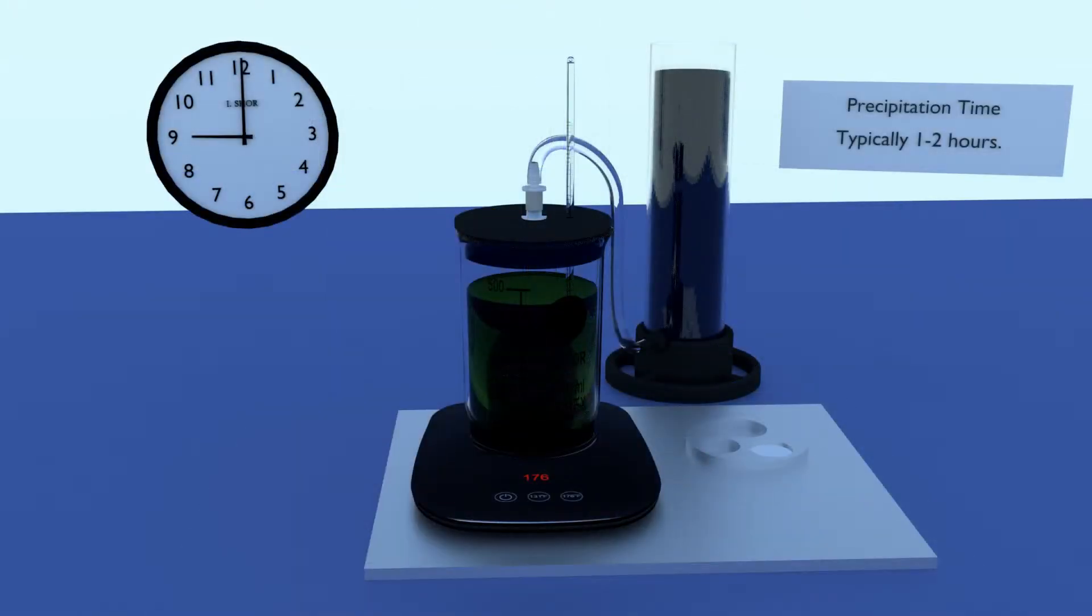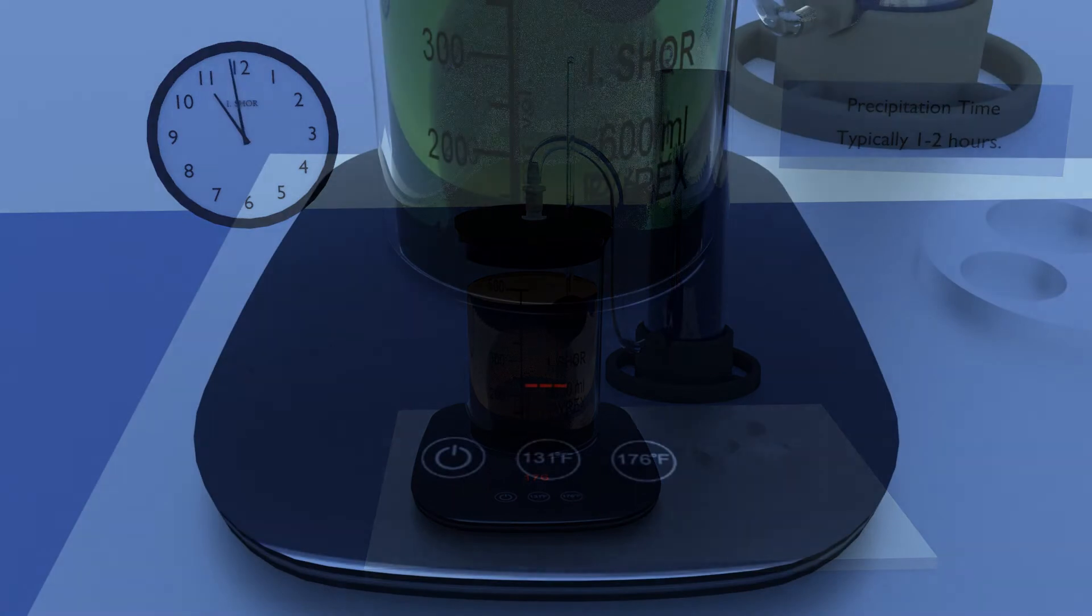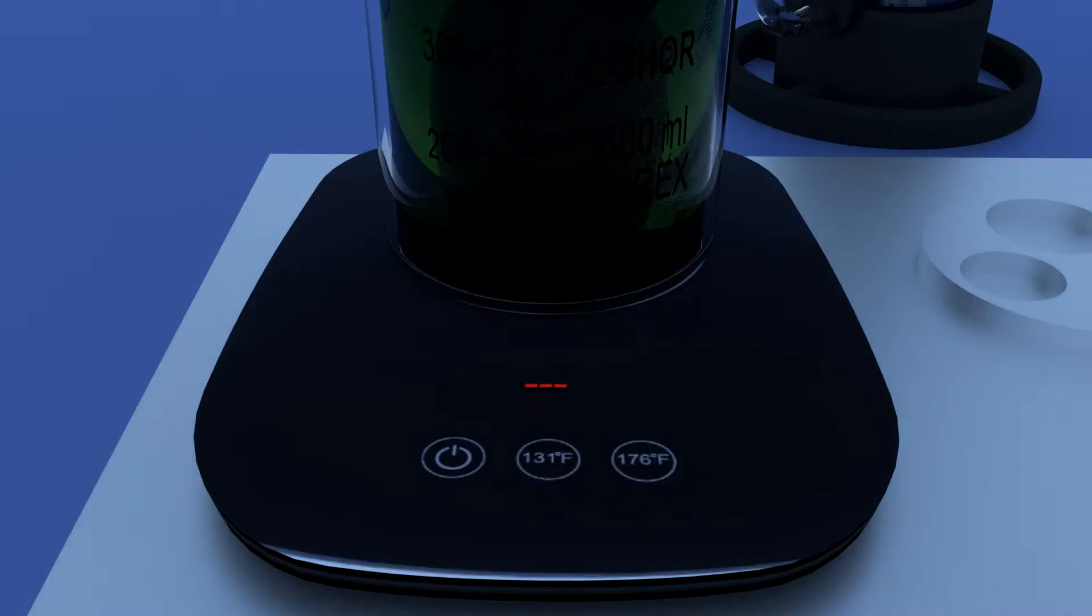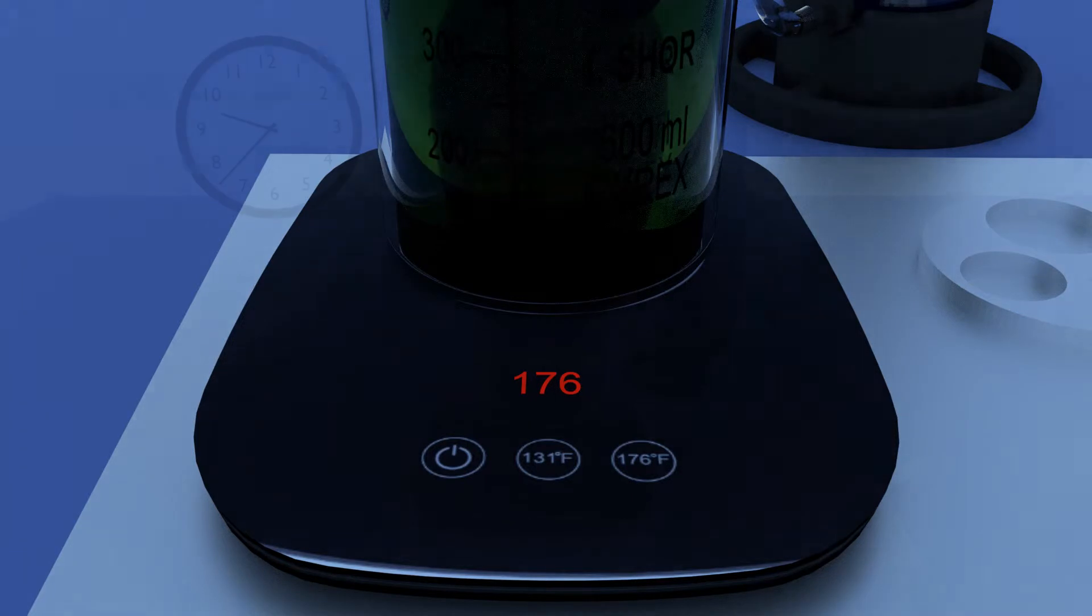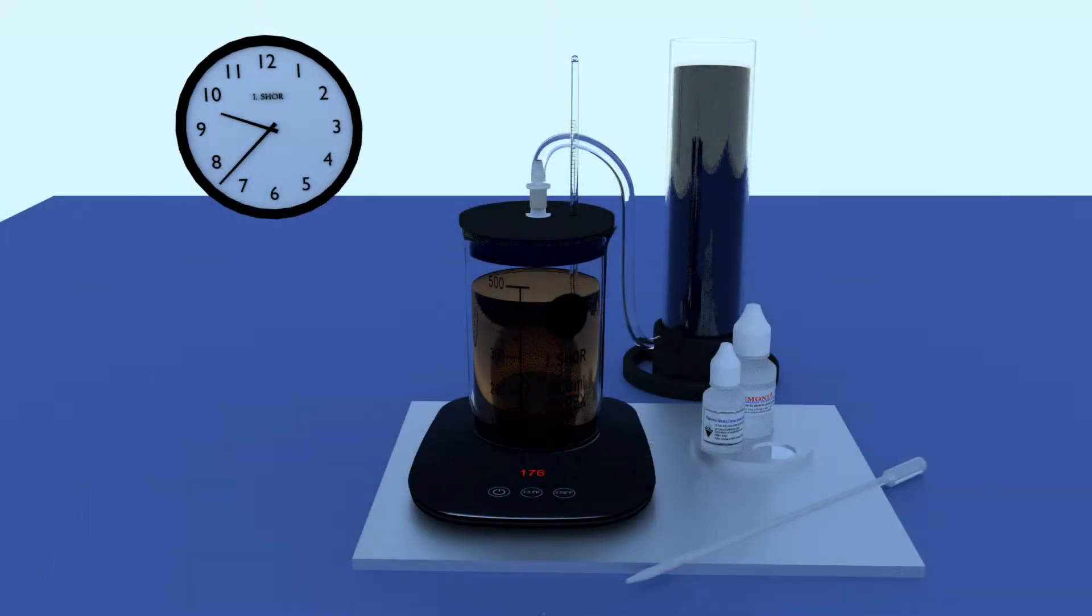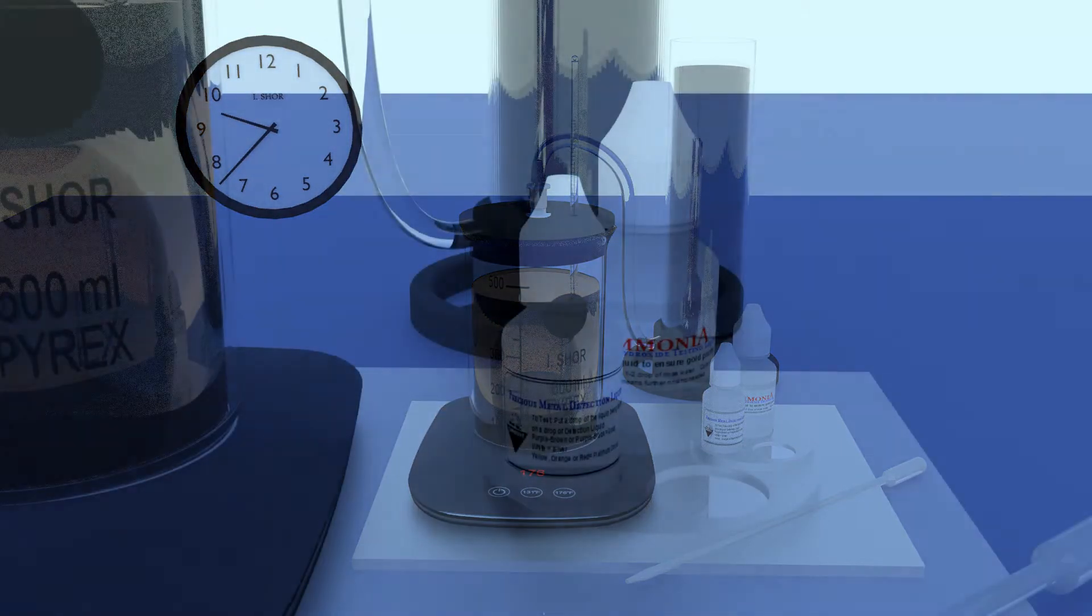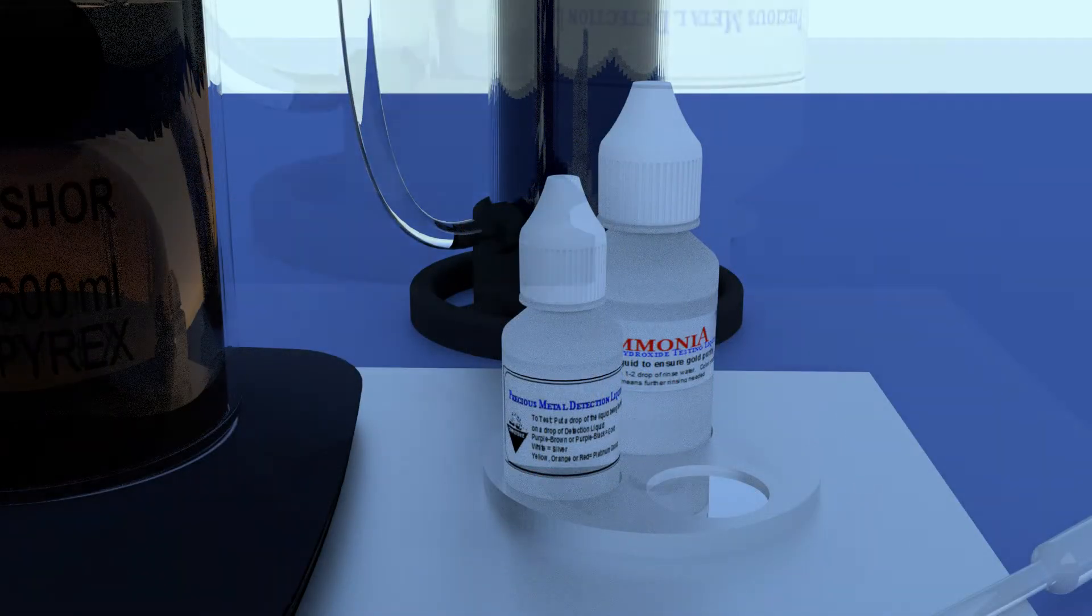Typical precipitation time is about one to two hours, but if it's more convenient to leave it longer, that's fine. The hot plate will automatically turn off if left running for a long period of time. No worries, just tap the on button to restore heat. So how will we know when precipitation is finished? The precious metal detection test will tell us.